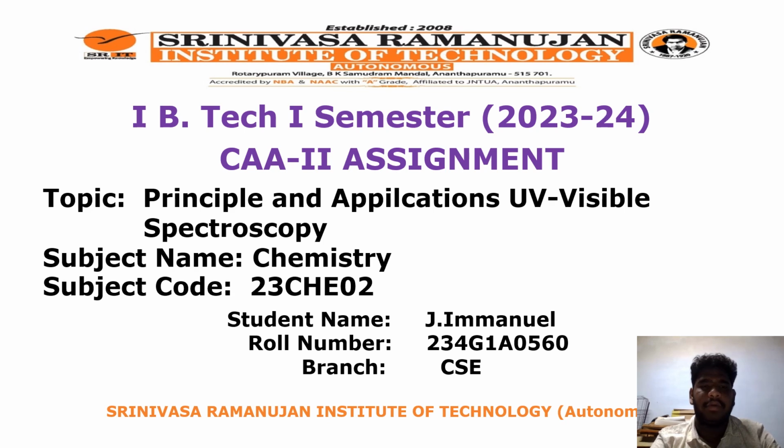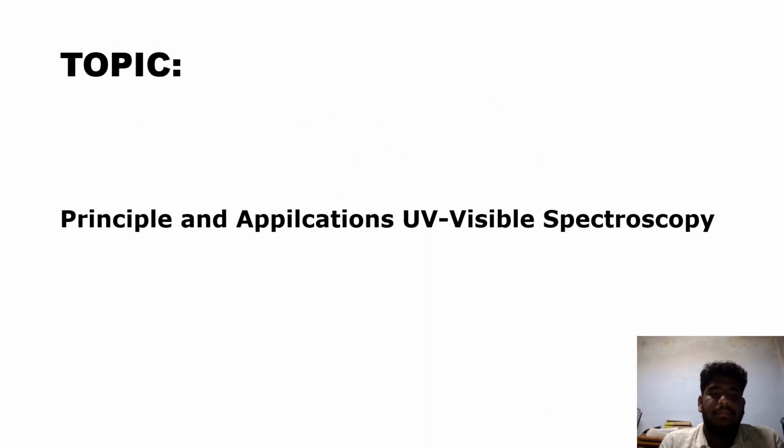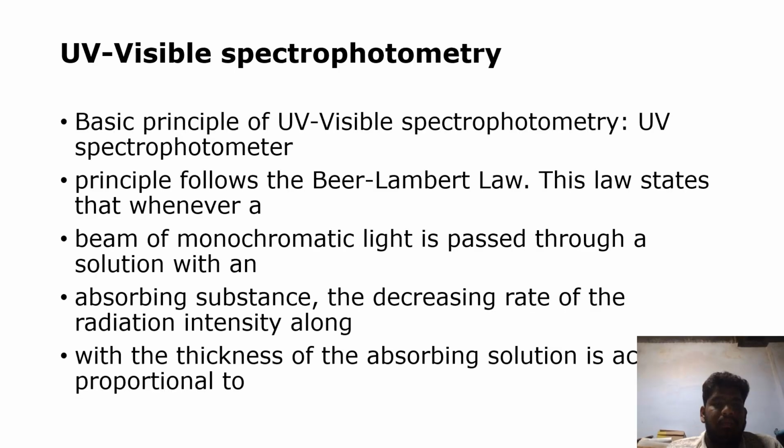Good afternoon, everyone. Today, my topic is Principles and Applications of UV Visible Spectroscopy. UV Visible Spectrophotometry. Points: Basic Principle of UV Visible Spectrophotometry. The principle follows the Beer-Lambert law.